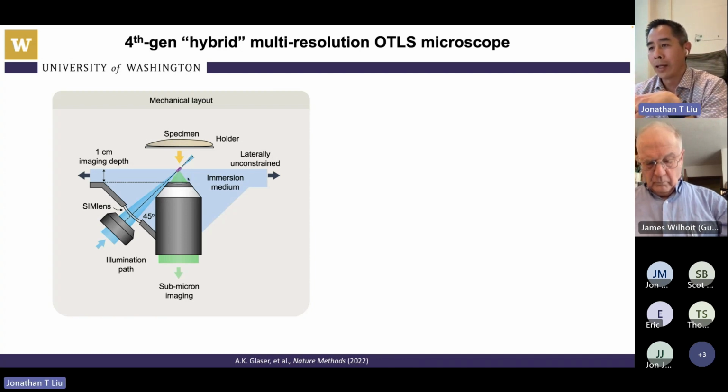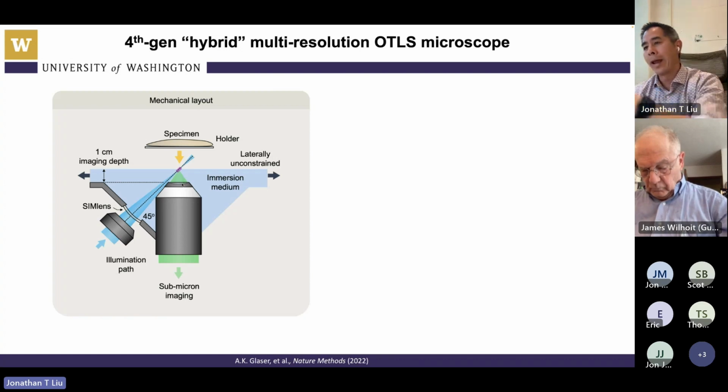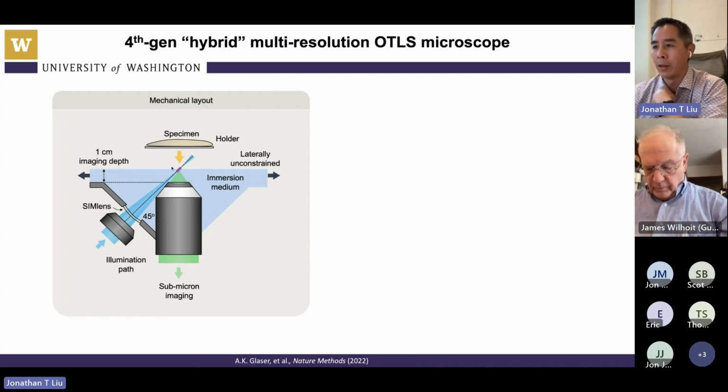It also has one of the higher NAs, a higher magnification than our previous systems. Also, by arranging this objective vertically, we have access to the full working distance of this objective, meaning we can image more deeply. If we angle this objective at 45 degrees, we will lose some of that distance because of the bevel of the objective, as well as the 45-degree angle coming in. This particular objective, our latest objective, has a 1 centimeter working distance. We can image, for example, whole mouse brains placed on our specimen holder. We can image through an entire mouse organ or large clinical specimens.